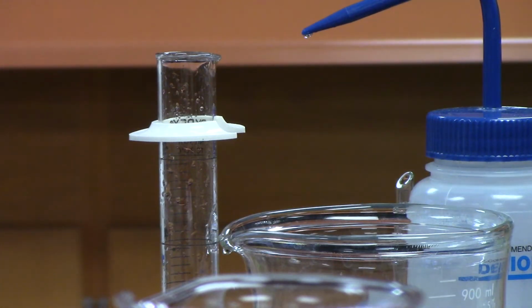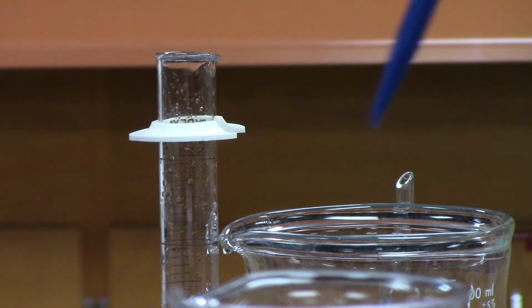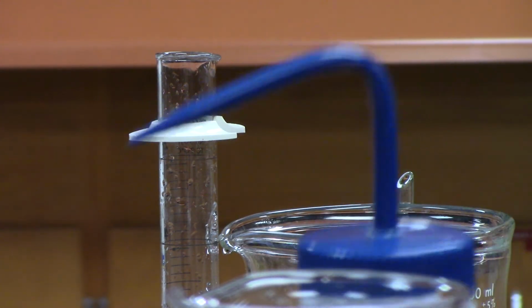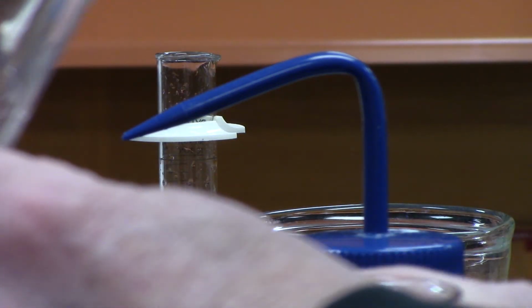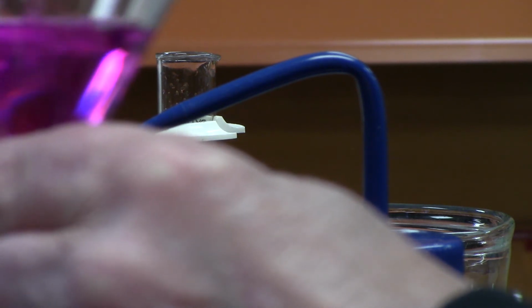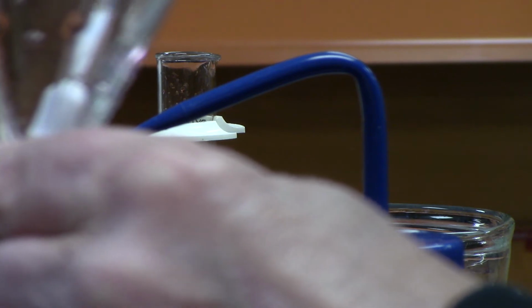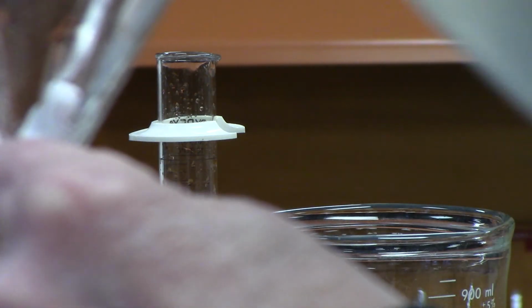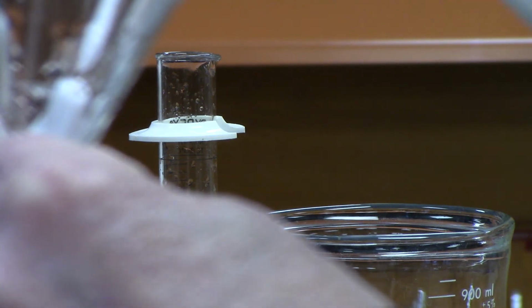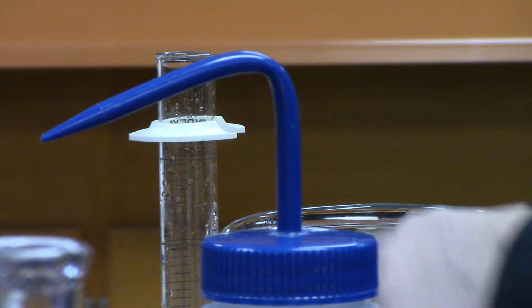Okay, next thing to do. Stir them up. I mean, it's pretty well already stirred up. Now what I'm going to do is transfer it to number 2, which is the next solution. Same thing. Again, I rinse out the filter funnel and the stir bar. Set both those aside. I'll get back to them in a minute.